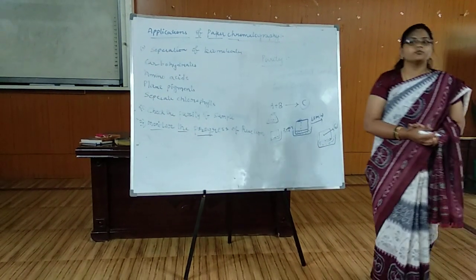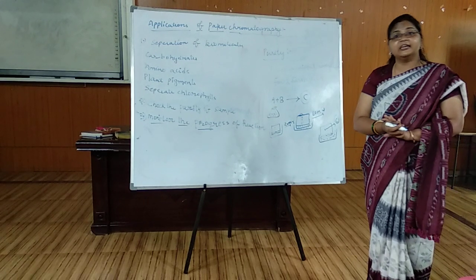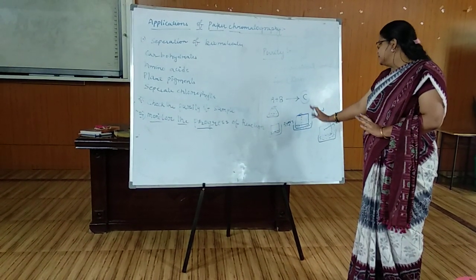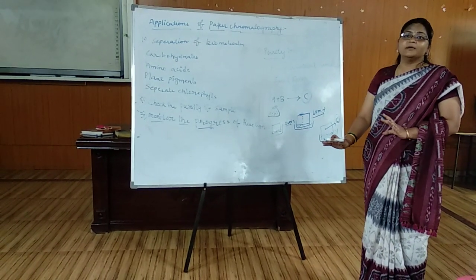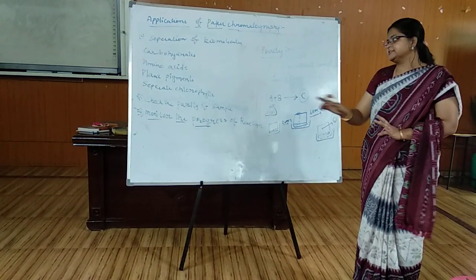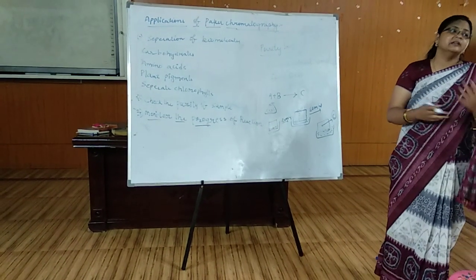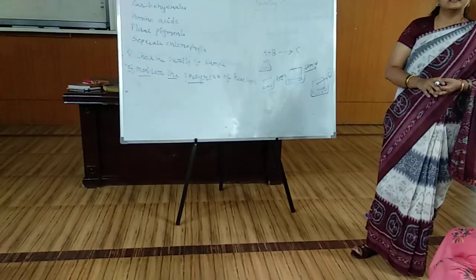So, in this way, paper chromatography, even though it is a simple basic technique, you can do so many applications on it. You can separate the components, you can check the purity of the sample, which is very, very important nowadays. Then you can also monitor the progress of a reaction, or you can check the completion of a reaction. Is it clear, girls? Yes.